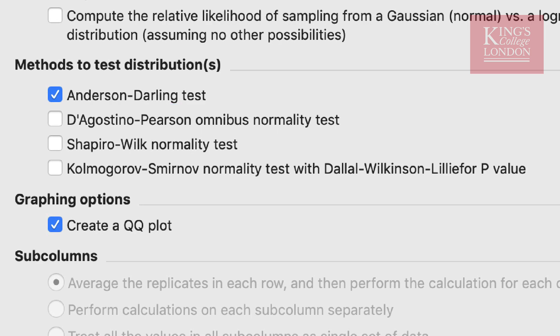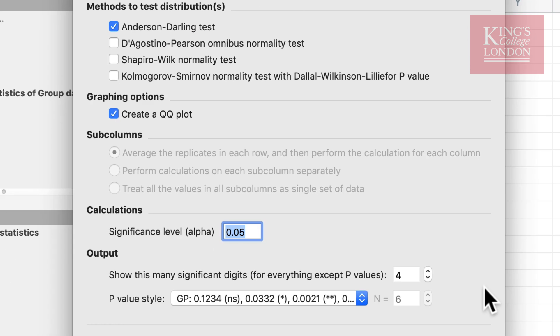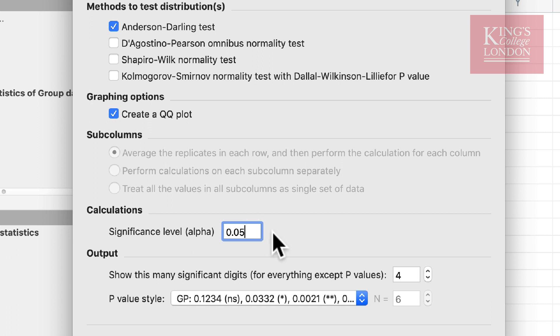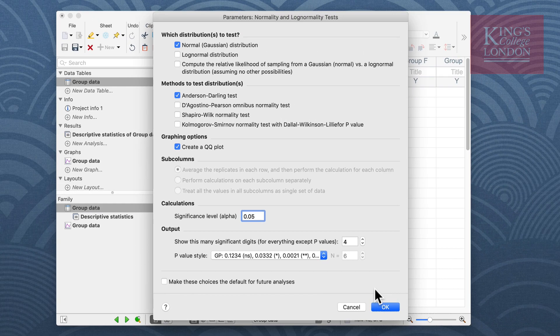If your p-value is less than 0.05, if you select your significance level for instance here and the alpha to 0.05, your data will not be normally distributed. We have an option to create a QQ plot and we also have some other options on how to display our p-value as we do in other statistical tests.